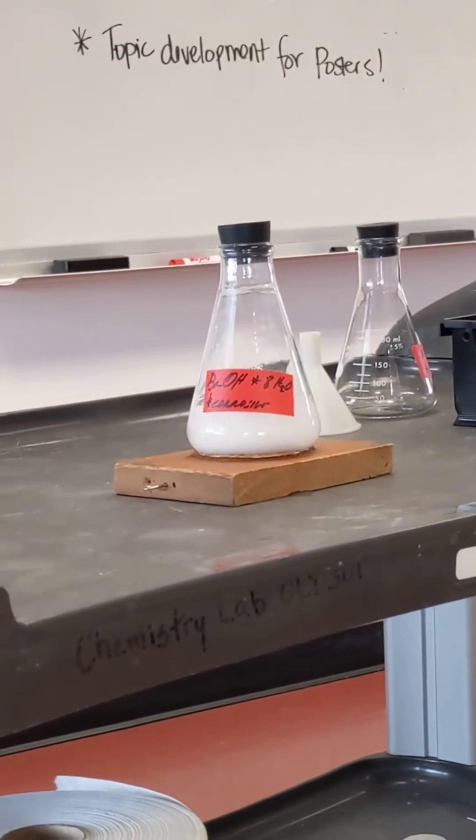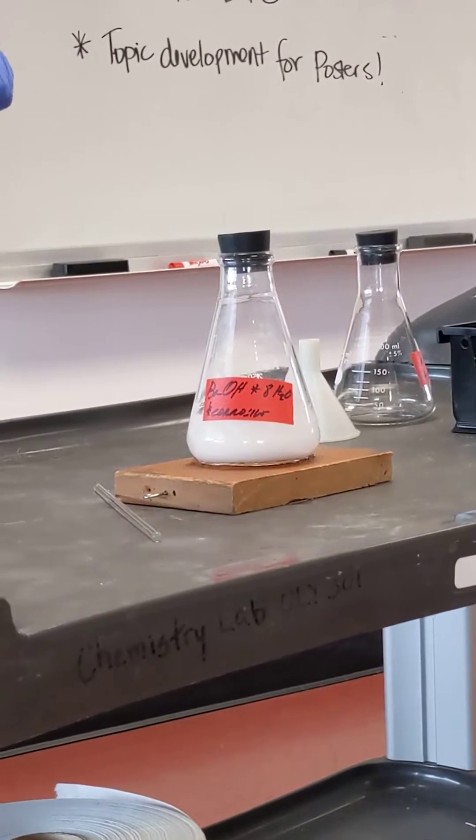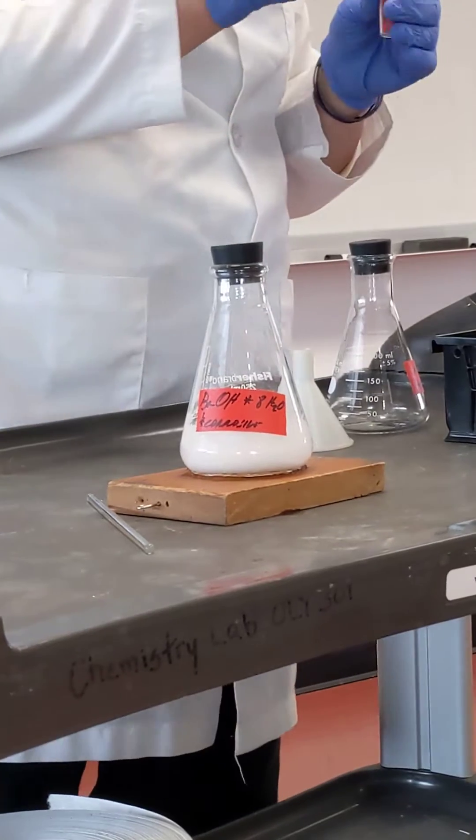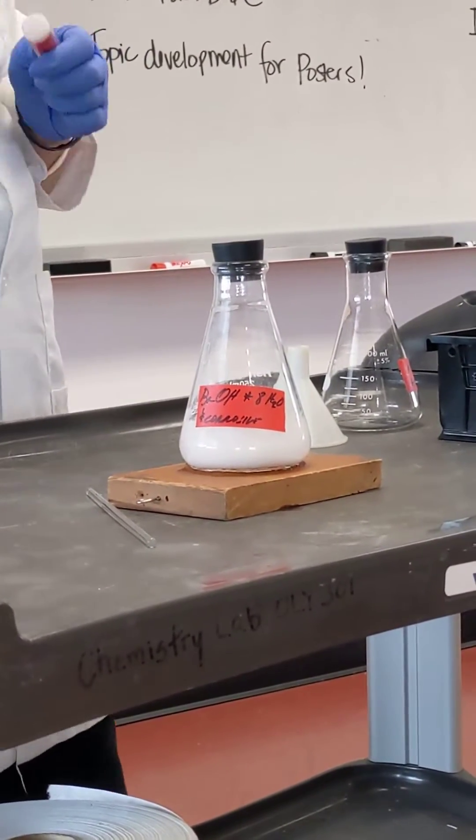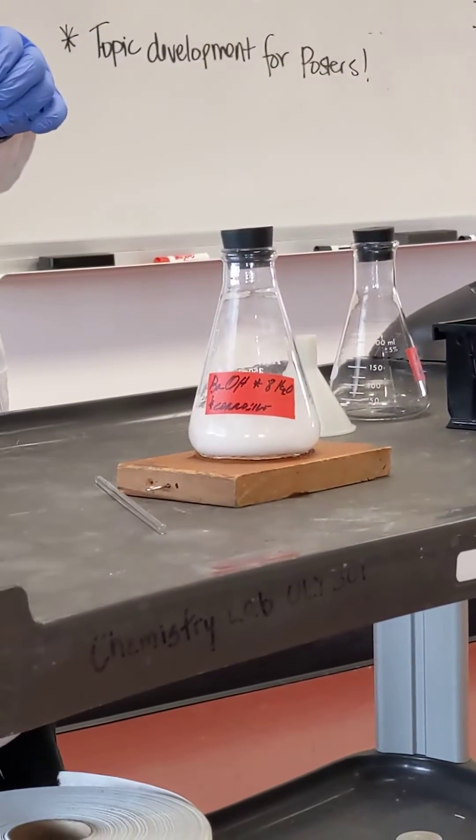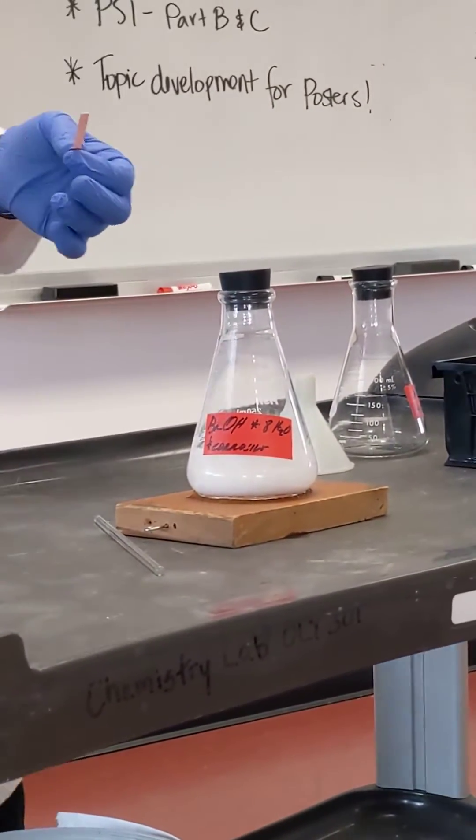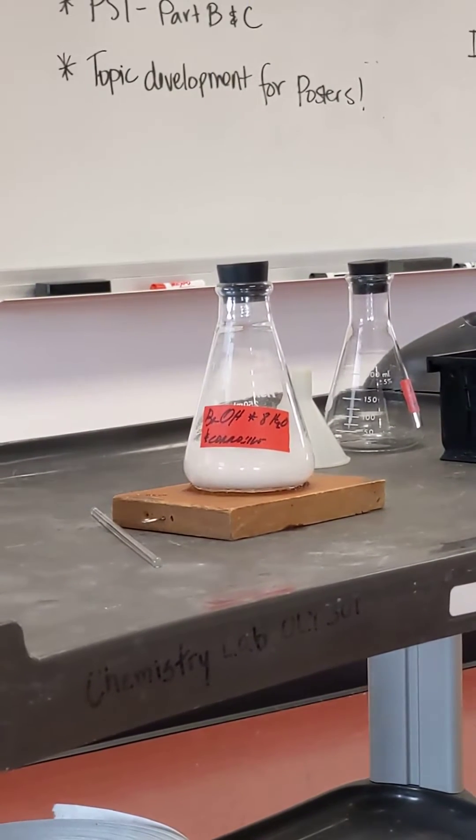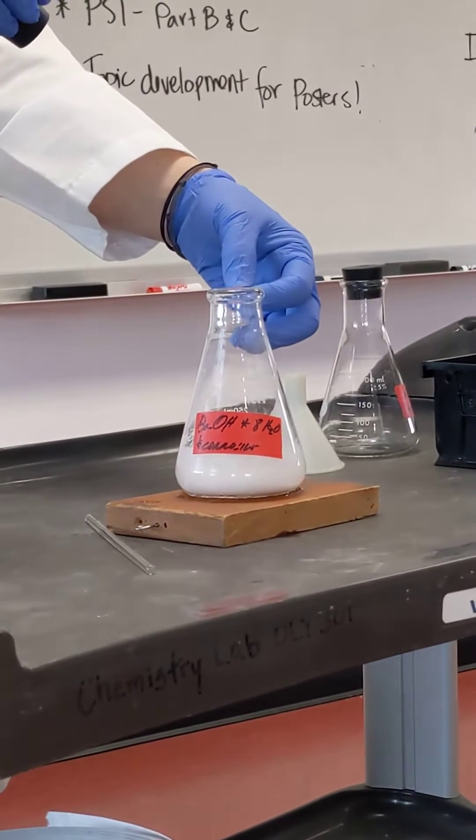While this is happening, I'm going to take pink litmus paper and test the pH of any gases being produced. So if this reaction is happening, we should be making ammonia gas, right? So it has to get the paper a little wet. I can do that. It'll take a while. Pink litmus paper should turn blue if a basic gas is being produced.